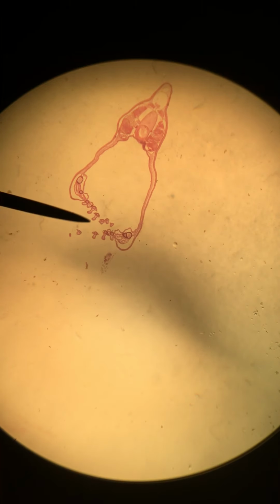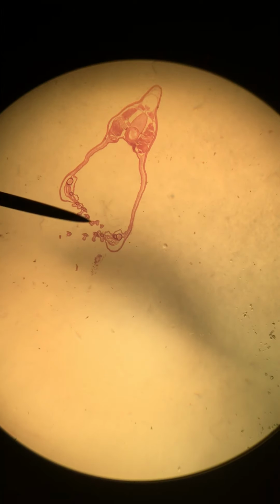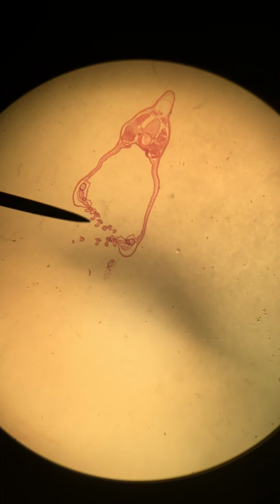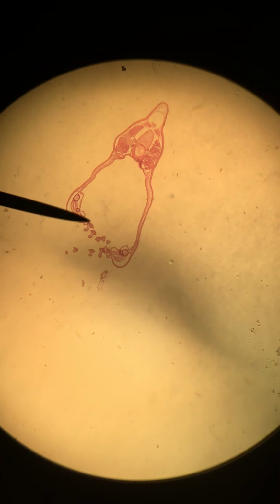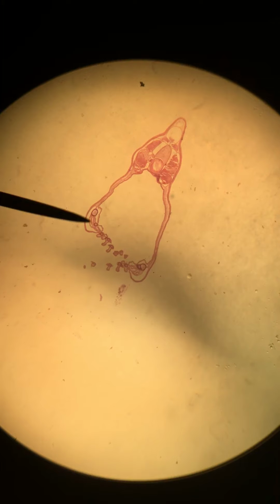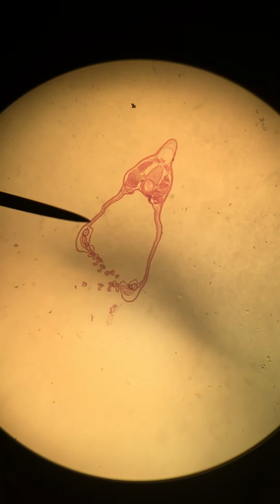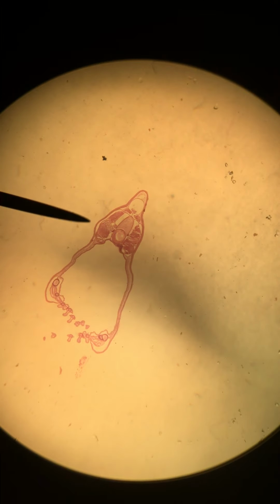These are the fragments of the buccal cirri, or the oral cirri. So those little tentacles we saw in the whole mount have obviously been fragmented in the processing of the slide, but all of these little particles here, those are your oral cirri, okay? And they were attached, of course, through the oral hood, which is along here. And of course, all along the outside, we have our epidermis layer.